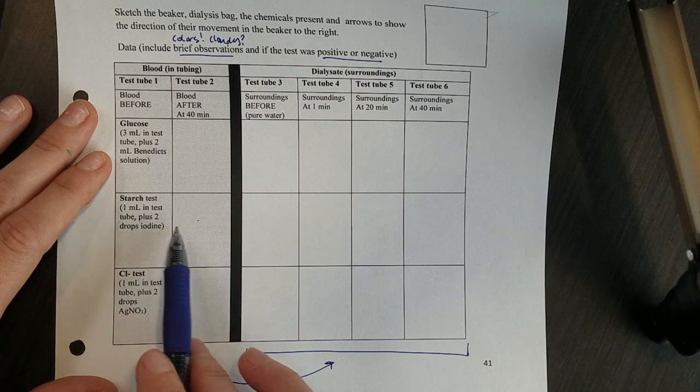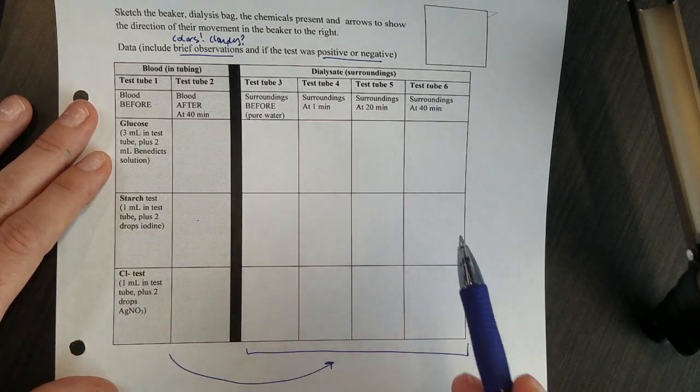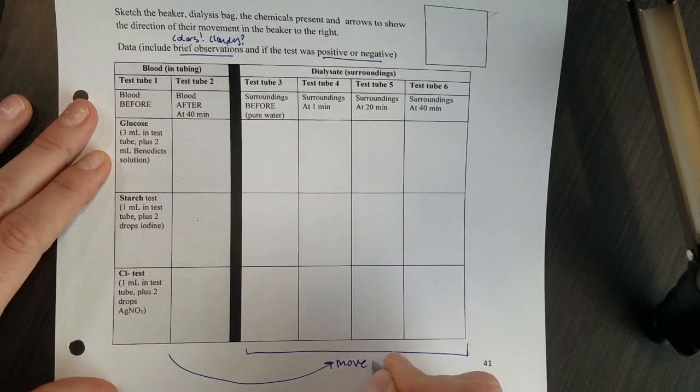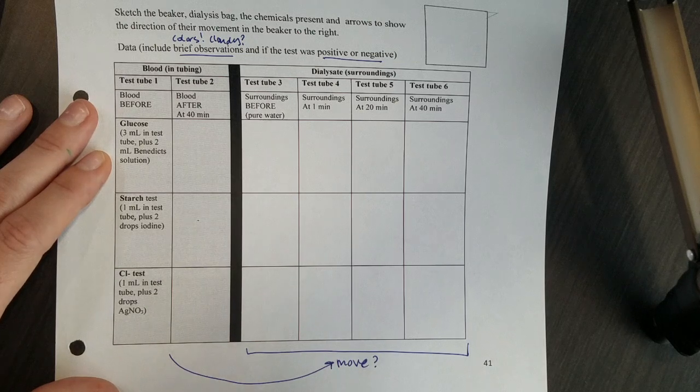If I have starch here and here that doesn't mean any movement happened. But if I have starch in the blood and then it shows up outside the blood, that's what I'm looking for. Do these solutes move out into the dialysate? Do they diffuse? That's the point.